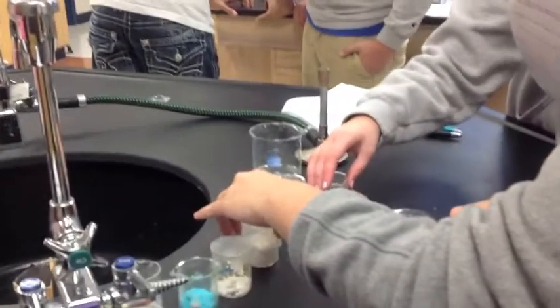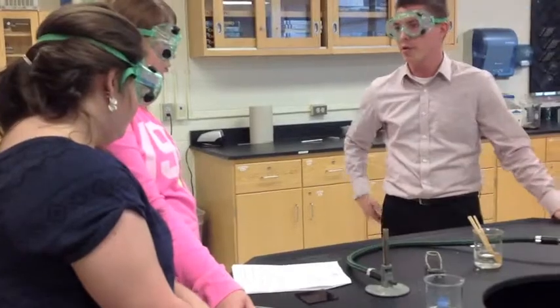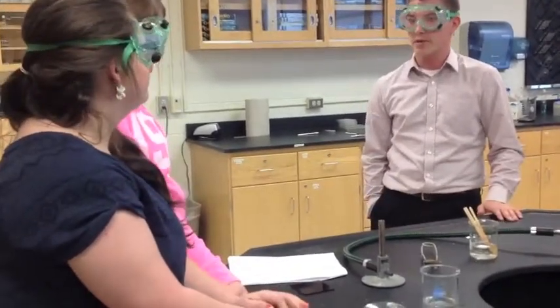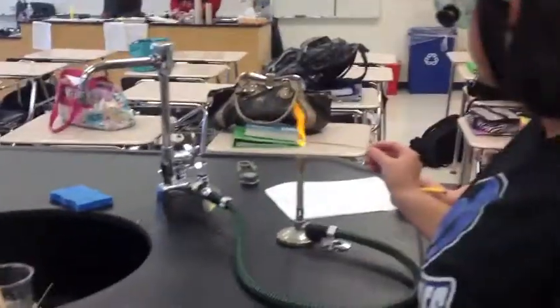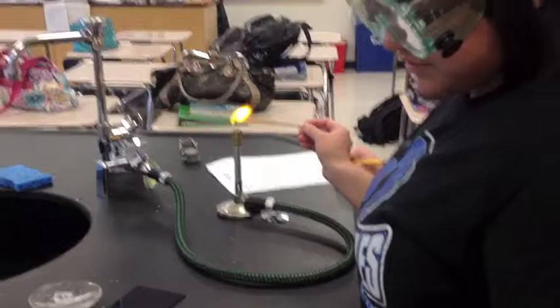Is this something we've not really talked a lot about? Quantitative data. Do you know what quantitative data is? Like involving numbers. Qualitative data does not. Those are more observations. So in this type of lab, what type of tests are we doing? Qualitative tests. Very good. That's exactly what we're doing. So I can see this is your data here, and then you found your unknowns. And now you guys are ready to just clean up your stuff and begin working on your post-lab.